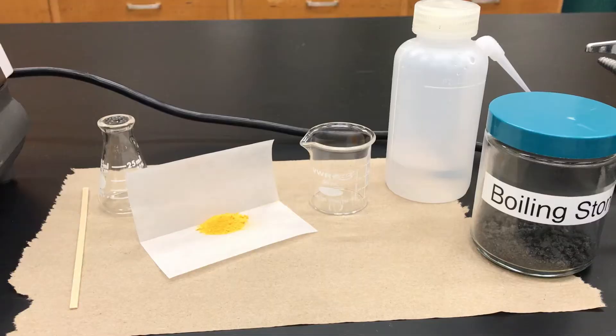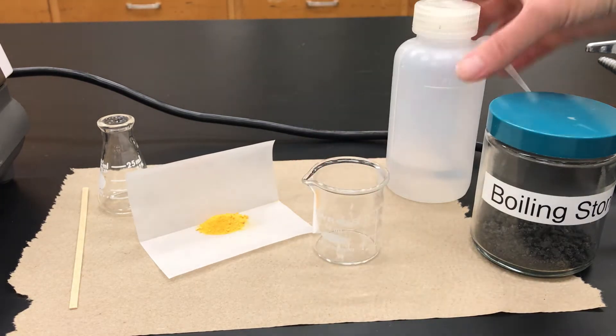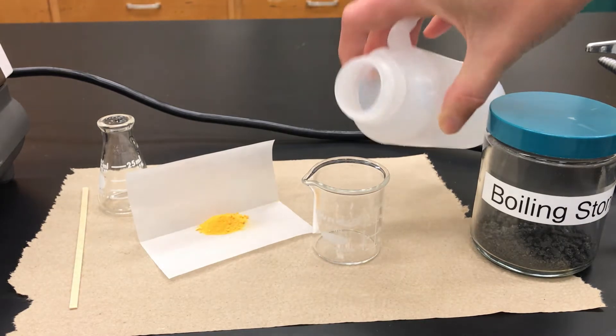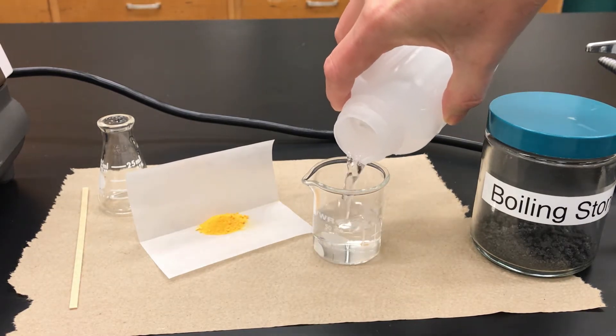The solvent is going to be water and I'm going to use a hot plate. Here I've assembled my materials and I've weighed out roughly a gram of orange impure NBS solid. Since this is pretty small scale, I'm going to use small beakers and a small Erlenmeyer flask, with water as my solvent.